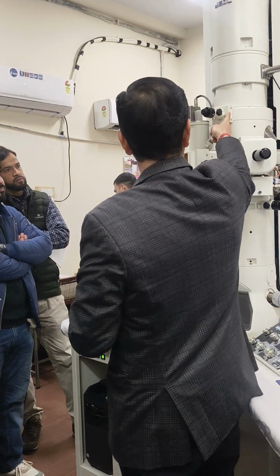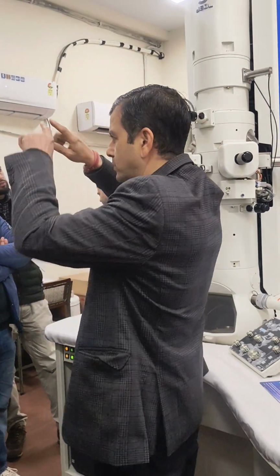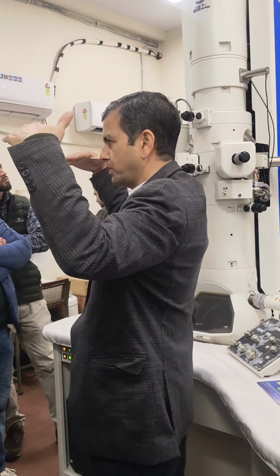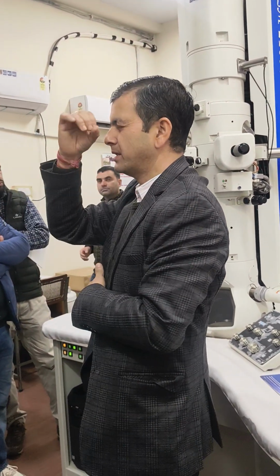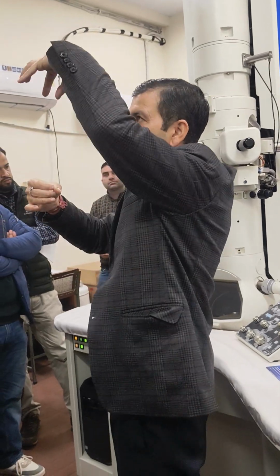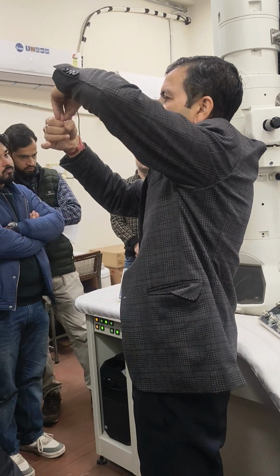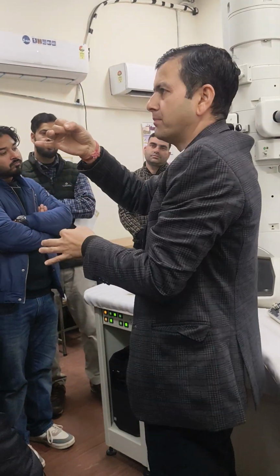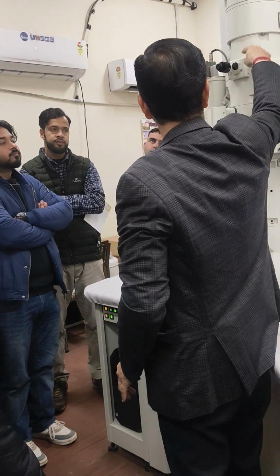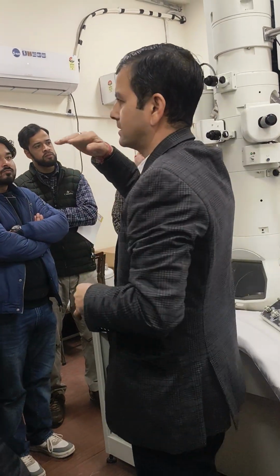Condenser lenses are there, with a movable condenser aperture. As sir told in the diagram, something is removed by putting a strip-like thing with a certain diameter. Suppose the beam is coming like this, it passes through a narrow diameter. The extra is lost as stray beam in the form of heat. Only a fine beam will pass. This is the purpose of this aperture.